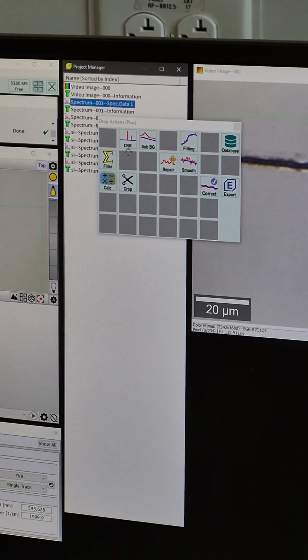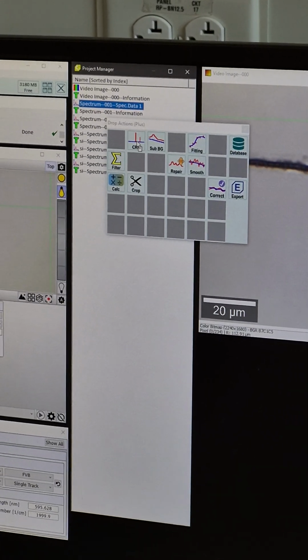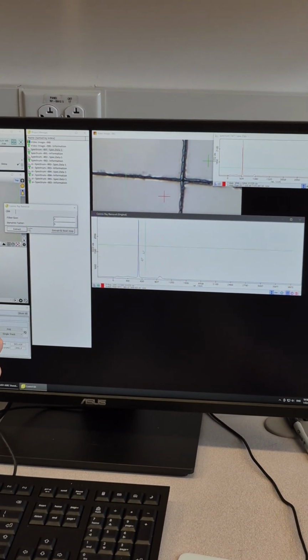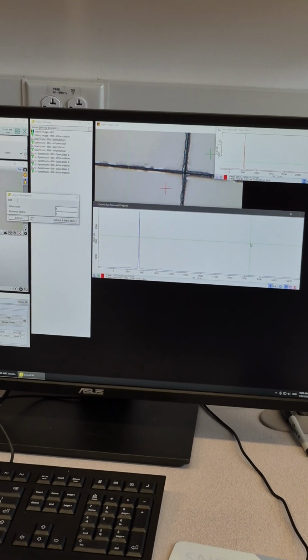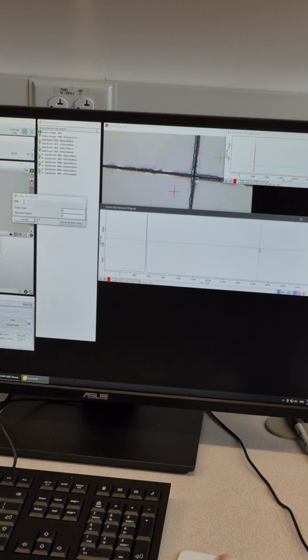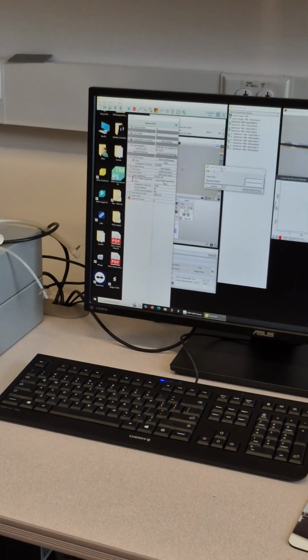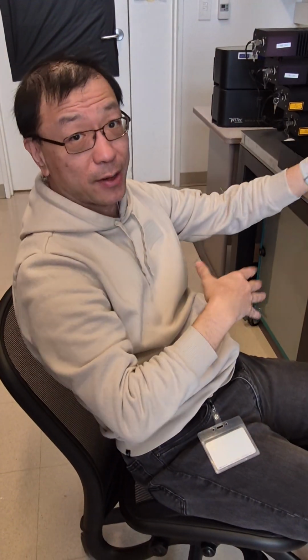The first one is called CRR. I just drag my sample, go to this window, and drop it there. Now it shows the CRR. For any action, it usually shows 2 spectra, one red and one blue. Right now, the red and the blue are perfectly overlapped, so you only see the blue. CRR means cosmic ray removal. We may have some contamination rays that come from somewhere, like the universe, and are collected by the spectrometer.